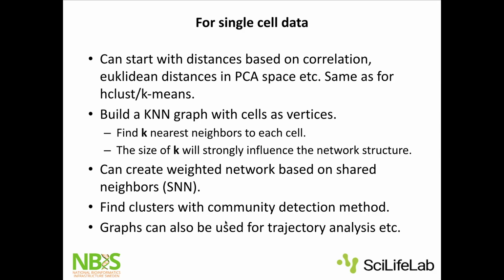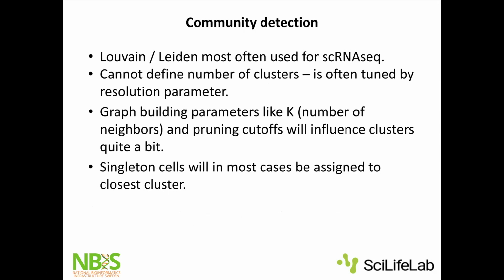Of course, these graphs can also be used for trajectory analysis and other kinds of things, but for now we're talking about clustering. And as I said, Louvain and Leiden are the most used ones for single cell RNA-seq. One issue with these methods for people that come from more traditional clustering is that you can't say beforehand how many clusters you want. This is quite frustrating at times.